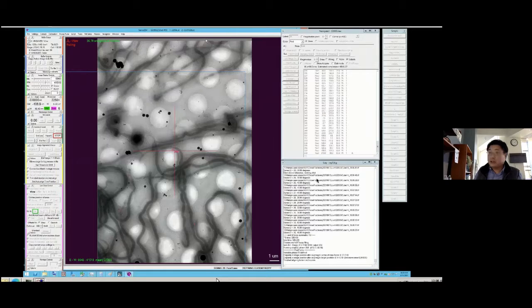And presumably this will continue. Since this is a demo, I will just show you, and this is a very long demo, 1.5 hours. So just feel free to ask questions, because this is a real data acquisition. I basically want you to know how data was actually collected, how we switch into a brand new sample, and then load the new sample into the microscope. This is all remote control. So presumably someday you may have this opportunity to control this yourself.